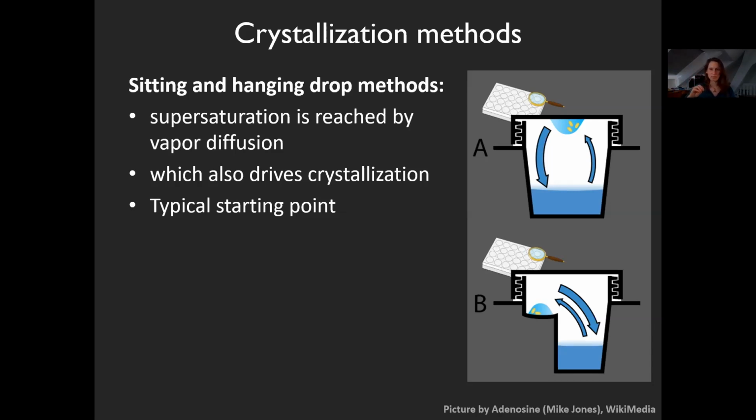And now what happens? The amount of dissolved molecules or ions in the bottom well is higher than in the drop. So there is a tendency of water to go into the space between the two and to accumulate in the well, because the system wants to equilibrate.